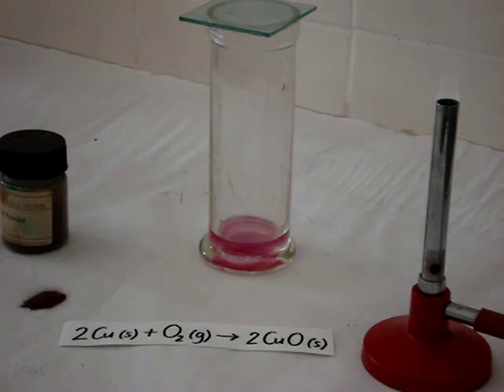Copper is a reddish brown, rather unreactive metal. We're going to try and react some copper powder with oxygen. We've got some oxygen in that gas jar.